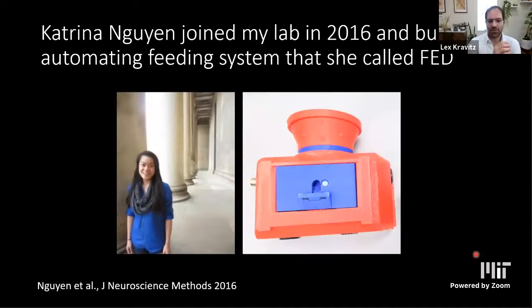So to give you a bit of history on the Fed3 and where that fits into this vision, Katrina Nguyen was a biomedical engineer. She's now a PhD student at Carnegie Mellon, and she joined my lab as a postdoc in 2016. She is a very innovative person with an engineering mind. She thought, well, why don't we make a little device that we can measure food intake? So she spent about a year designing a 3D printed device that's controlled by an Arduino, and she called it Fed. This was the original one.